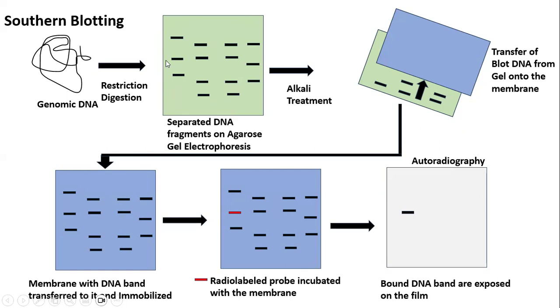You can purify the DNA from the cut DNA fragment, and then you can use it later for sequencing to identify what sequence it is, or you can do cloning or whatever experiment you want to proceed with it.